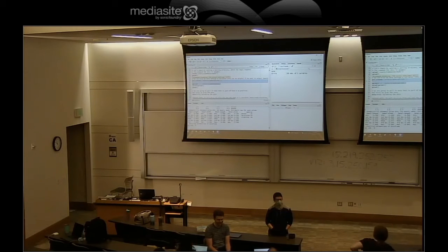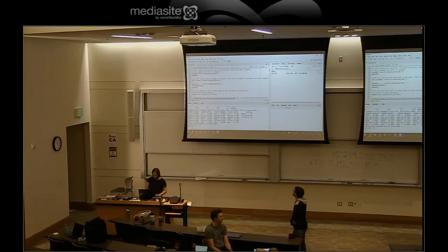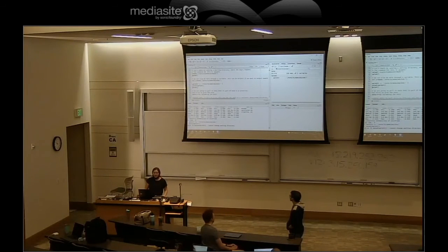Guys, when you set your working directory, if it didn't exist, it'll still create this variable. This is a fake path. This doesn't exist. But when I actually try to set it, you'll see in your console that it cannot change to this working directory. So make sure that you set your actual directory to a directory that exists and that this red thing didn't pop up in your console.